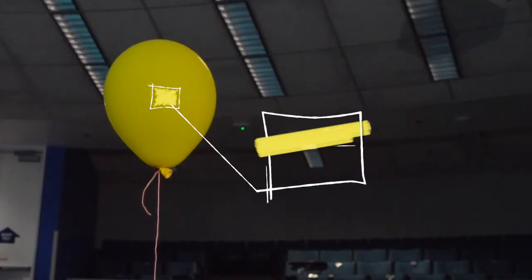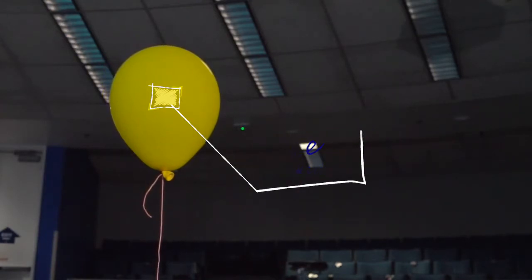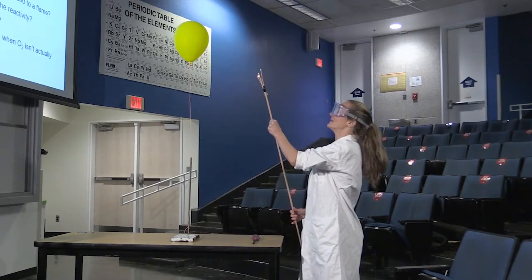And our second balloon, we have helium. So let's think about, what do we know about helium? Well, we know that it is a noble gas, and I hope that at this point in the semester you might think, well, the electron configuration of helium is a full closed shell in its valence orbitals, right? So, I wonder if that will have anything to do with its reactivity. Let's find out. So here comes our helium balloon.